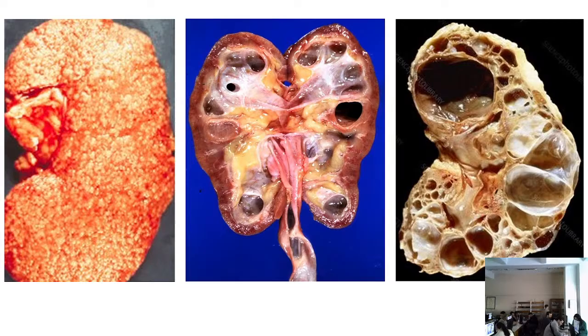And now we'll see the other cause that may destroy the kidney, which is in the middle. What do we see here? We see that the renal cortex is thinned. Look how thin it is by comparison to the normal kidney we previously saw. And you have all these distended areas. Here is the renal sinus fat tissue and distension of the ureter as well.